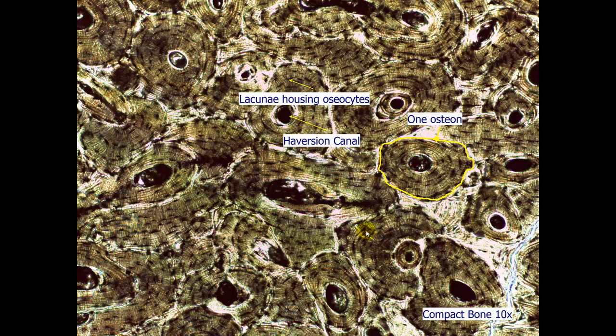Here is a slide showing compact bone. Each of these bullseye looking structures that we see in this slide is one osteon. This osteon has several structures within it. One of the main ones being a haversion canal that is the central canal that runs through the osteon that carries the blood vessel and the nerve. You also have these black spots that we see everywhere. These black spots are the lacunae that are housing osteocytes or the bone cells themselves.